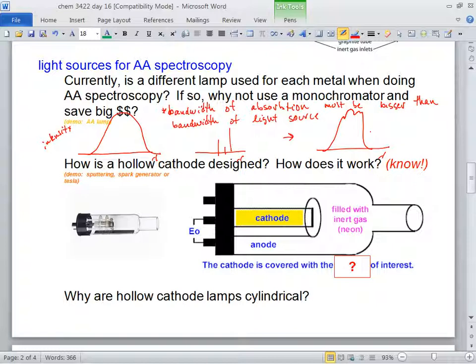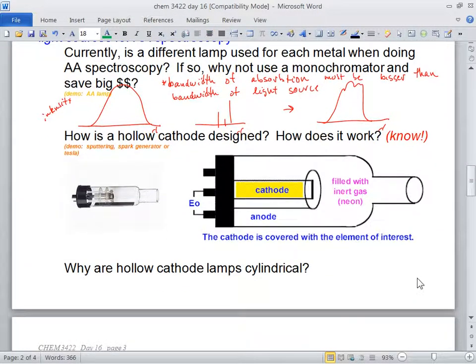Here's an AA lamp. It's all wrapped up because if you drop it, glass could go places. Here's a hollow cathode lamp. We said that we have a different lamp for every metal. The cathode is covered with the metal of interest. If we want to look for calcium, the cathode is going to have calcium metal on there. Mercury, it'll have mercury metal. Why is it cylindrical? Well, let's answer this question first: how does it generate this light in the first place?